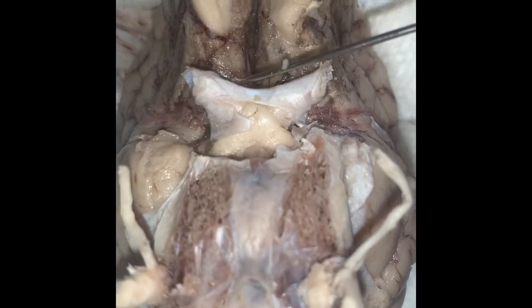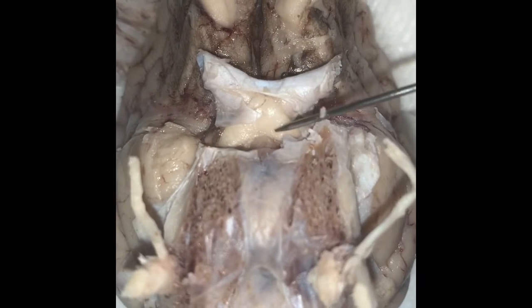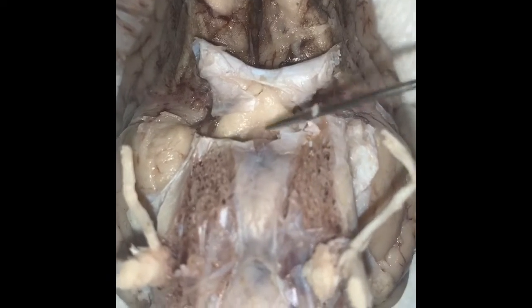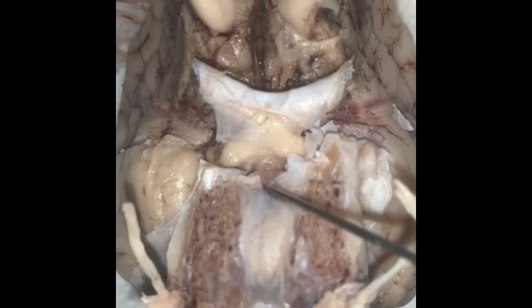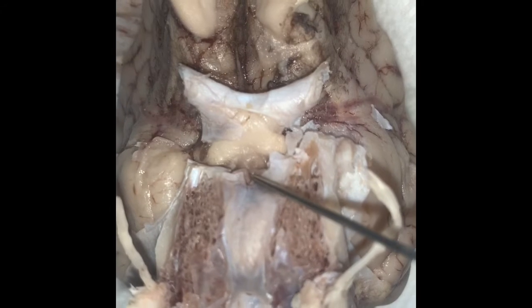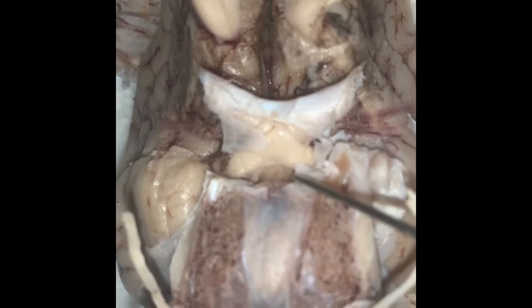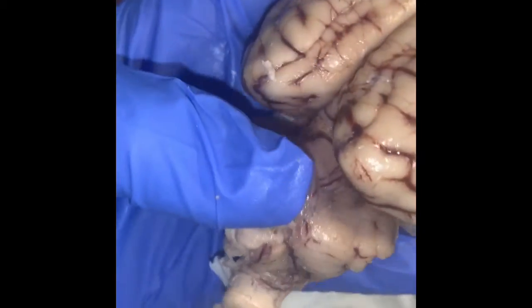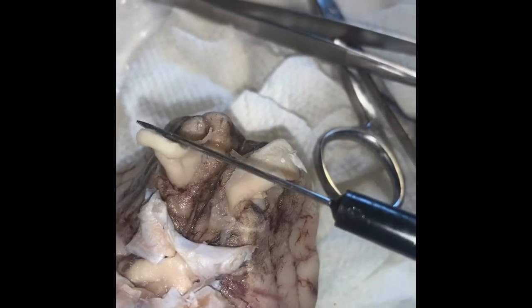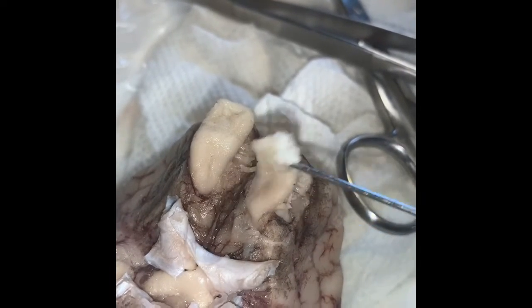Okay, I was able to get it a little more removed. So right here are the optic nerves, and this right in here is the optic chiasm, and the little one right in there, a little hard to focus, is what I believe is the infundibulum. A little hard to say where the pituitary gland was. I'll just show another view too. I was able to get more of that removed, and there is a better view now of my cerebellum back here. All right, so right in here is our olfactory bulb and tract on both sides.